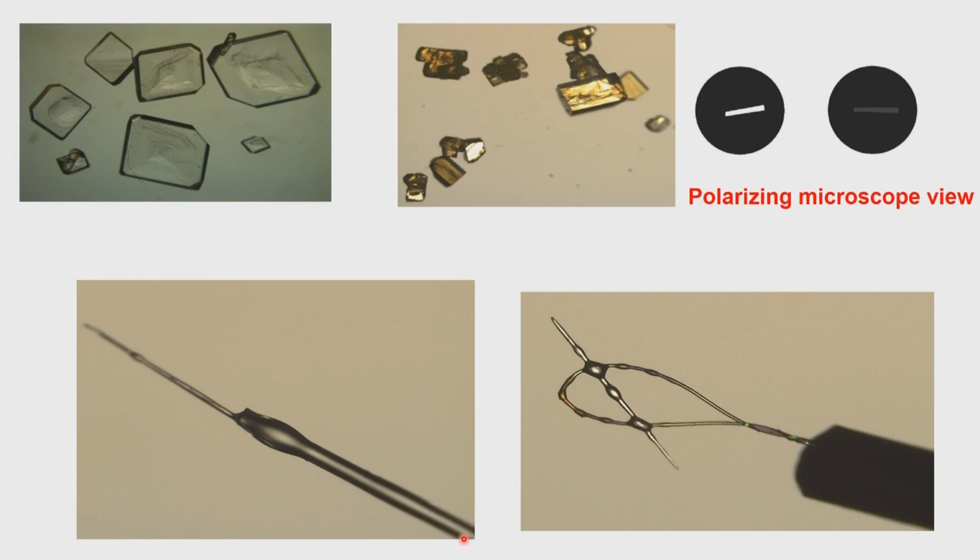Now, on the goniometer, we can have different ways in which we can mount the crystal. One of the ways in which it is normally mounted is to take a glass fiber, and at the tip of the glass fiber use epoxy of some kind and then mount your crystal. This is a needle crystal which is mounted up here.